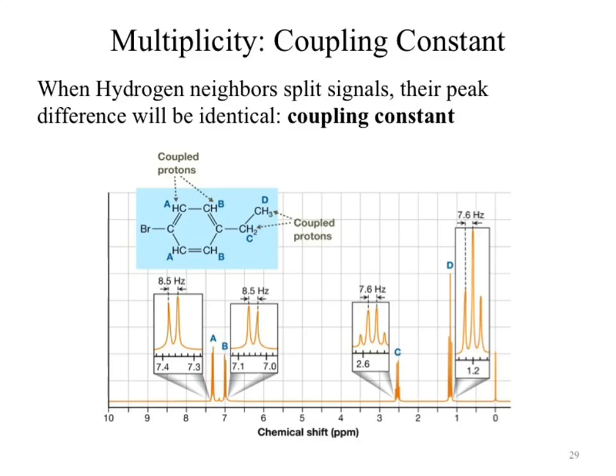If we go through and look at this spectrum, you'll notice the 2 signals that we see up in the aromatic range. How do you know it's the aromatic range? 6 to 8. You memorize that table that I told you to go through and memorize in the videos. Those aromatic signals are showing a coupling of 8.5 hertz. If we look at the signals in the alkane-ish range, the distance between the peaks is 7.6. What does that mean? The hydrogens in the alkane region do not see the hydrogens in the aromatic region. They are not coupled to each other, which means they are not neighbors.